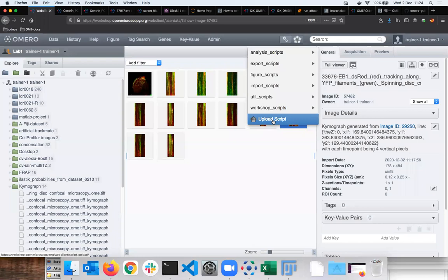It does not mean that the script can be run indiscriminately on anybody's data. Note that it always depends who is running the script. But the danger is if somebody uploads some innocuously looking but intrinsically dangerous script, then an unsuspecting user can click on that script thinking that he is doing the convolution and in fact deleting his or her own images. That's why it's good if I have a new script that somebody in a position of authority and responsibility has the power to check the script before it's uploaded for everybody on that OMERO server.